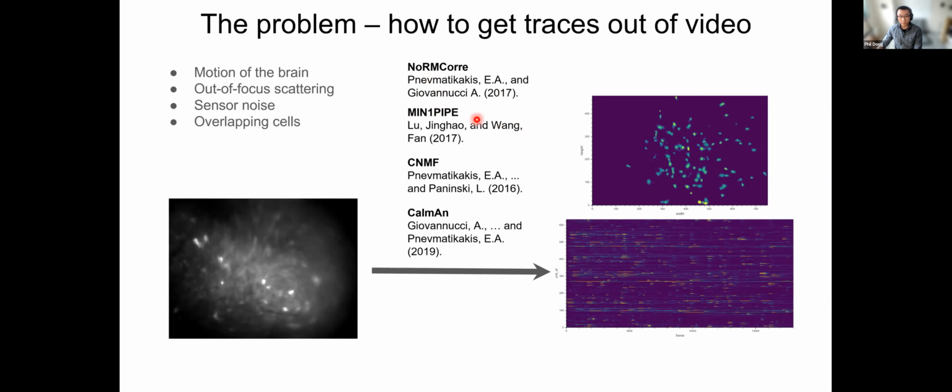So for example, here I'm showing a 3x3 identity kernel. It's basically not doing anything at all because the weight of the center pixel is 1, and all the surrounding pixels don't contribute anything to the new value. So the result of this is basically you get the same picture in return. It's not really doing anything.